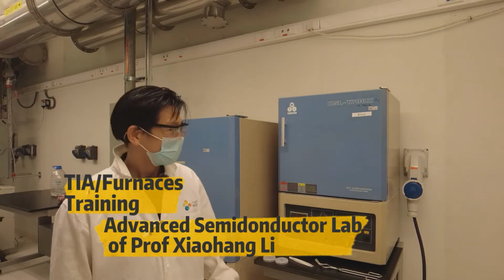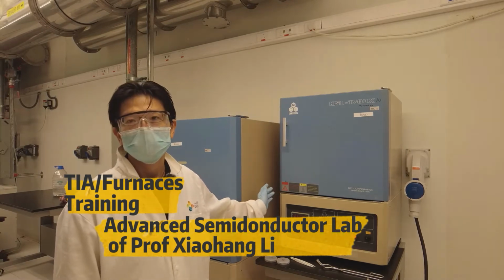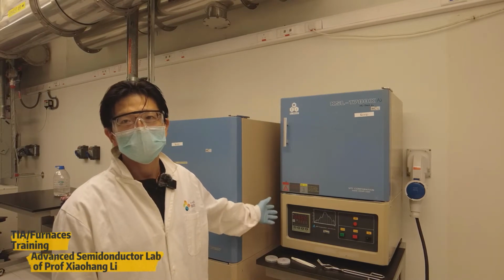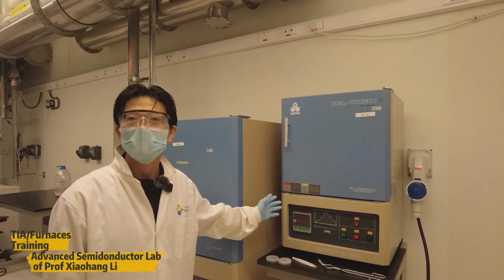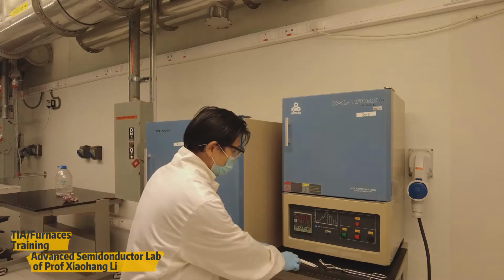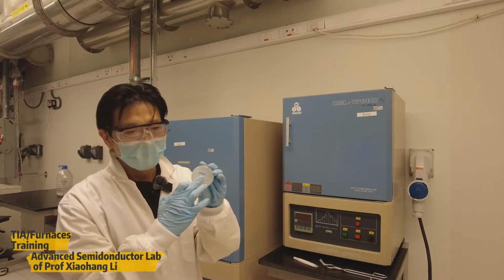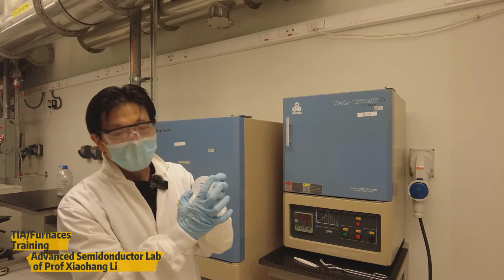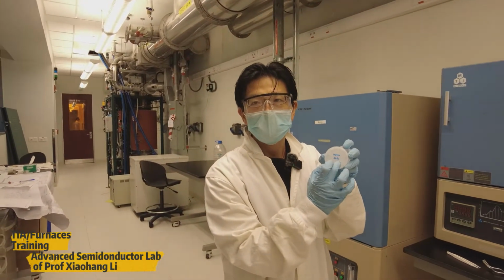Right now we are gonna do this furnace. We will use this muffle furnace to do our TIA, thermal interdiffusion and alloying method, to diffuse our PLD-deposited gallium oxide on aluminum oxide, so-called sapphire substrate.